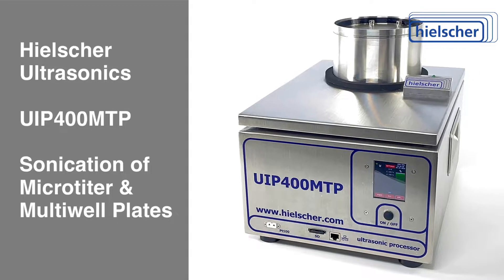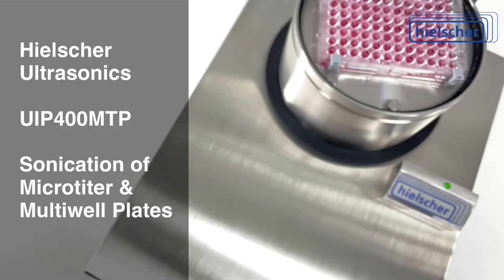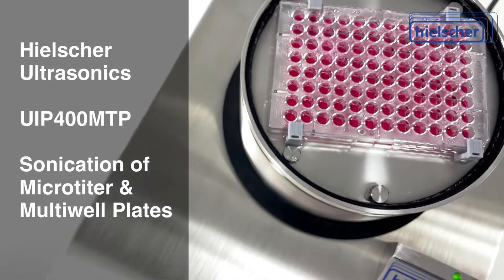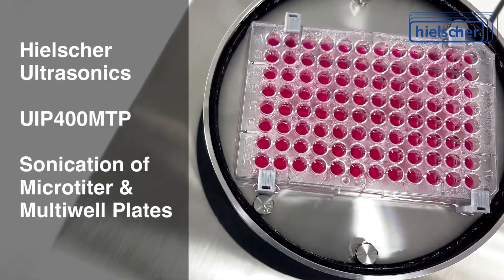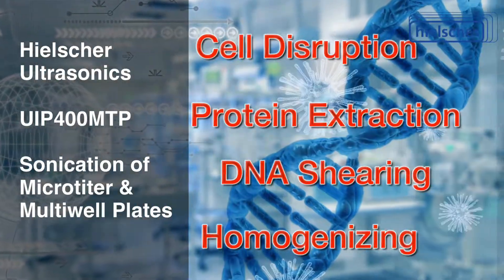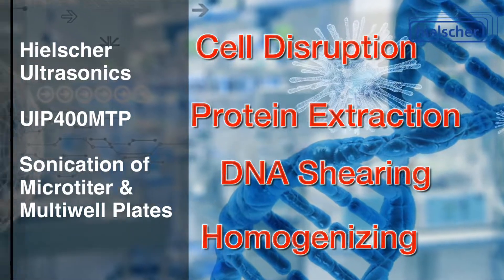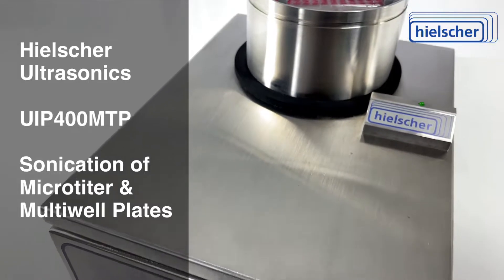The Hielscher UIP-400 MTP is an ultrasonic sample preparation device for almost all microtiter or multi-well plates and for many vial holders. Its sonication intensity is up to 50 times higher than that of an ultrasonic cleaning bath. With up to 400 watts of ultrasonic power, cells can be disrupted, proteins extracted, DNA sheared, or samples homogenized. The UIP-400 MTP is an indispensable tool in many labs.